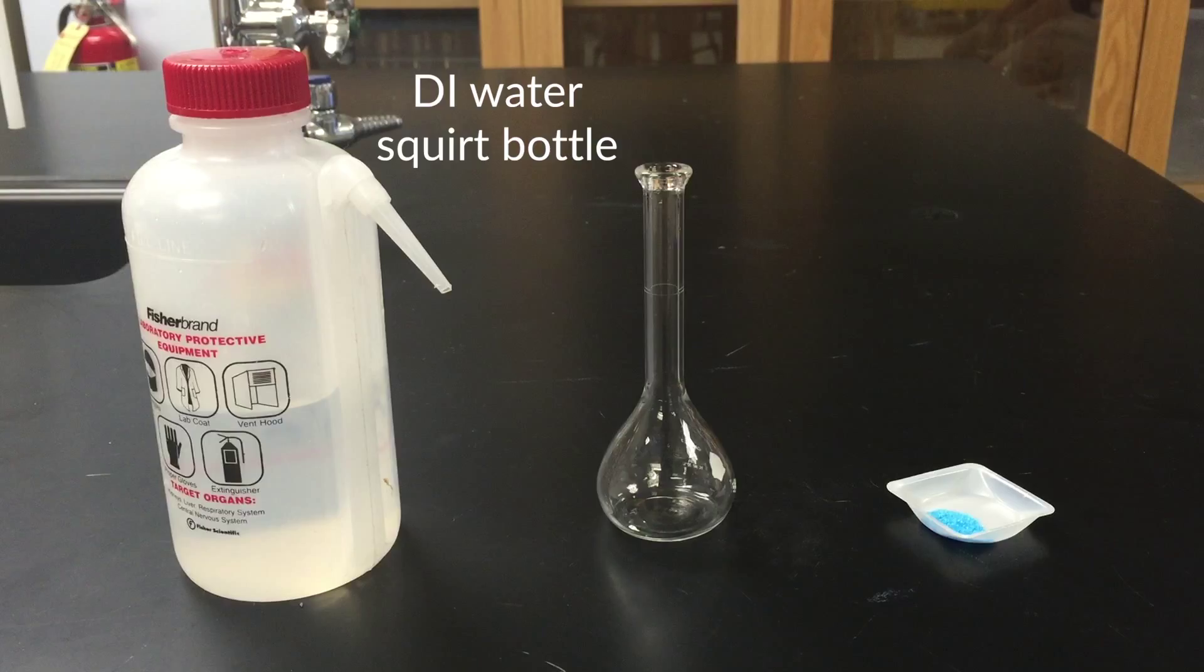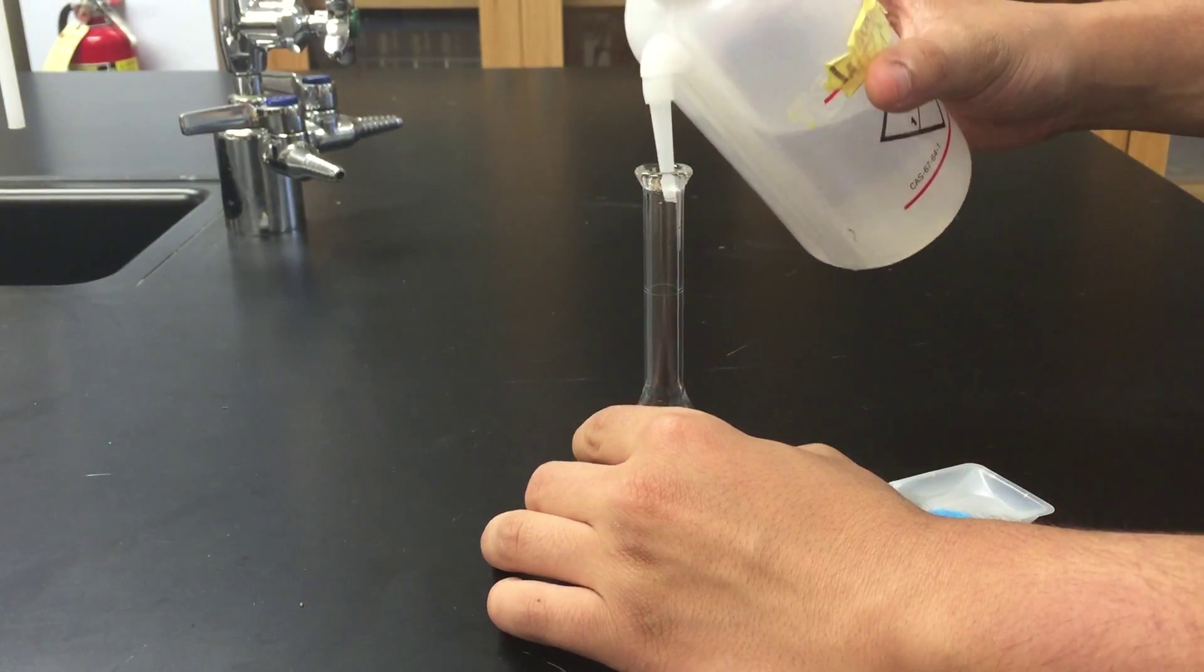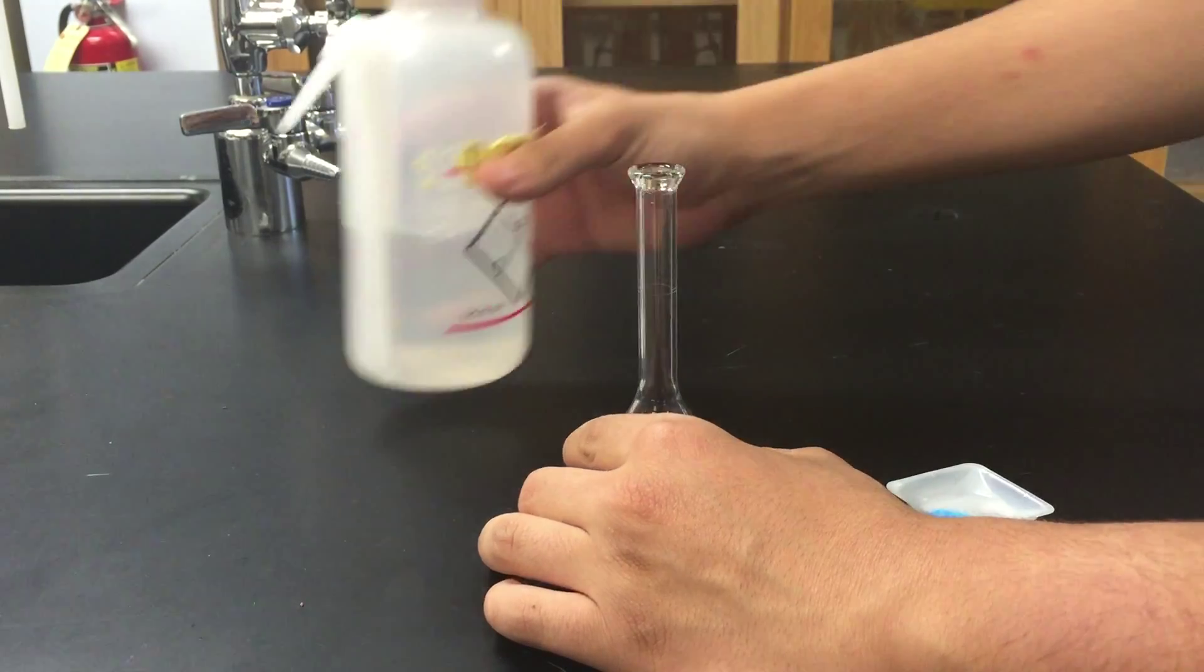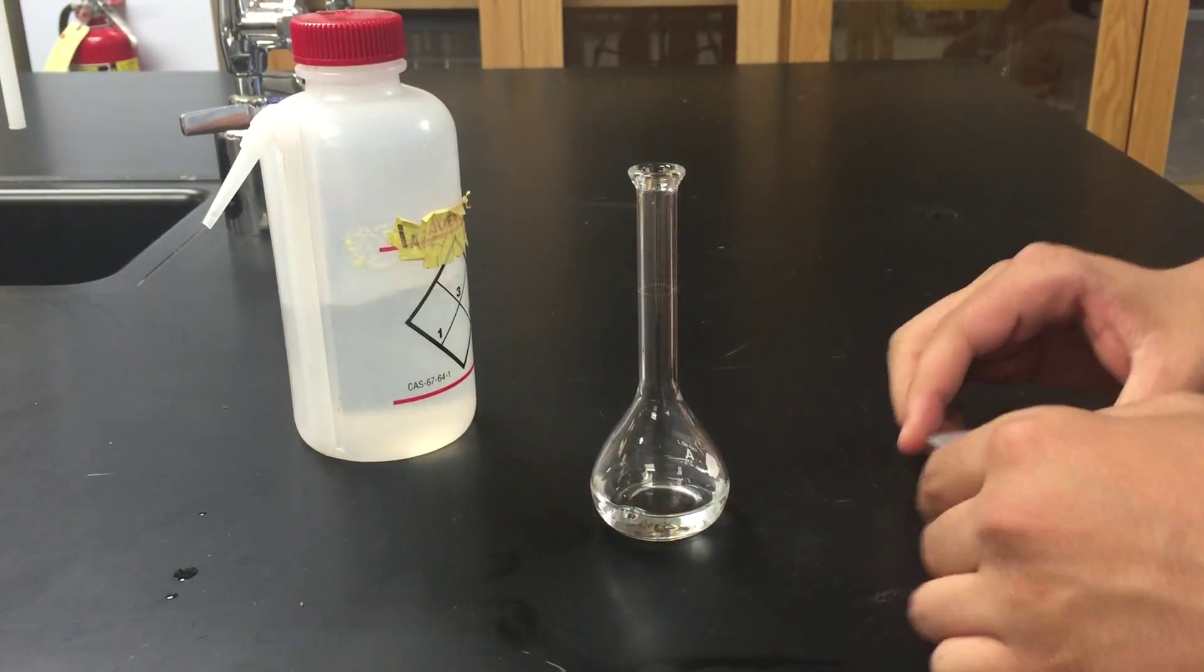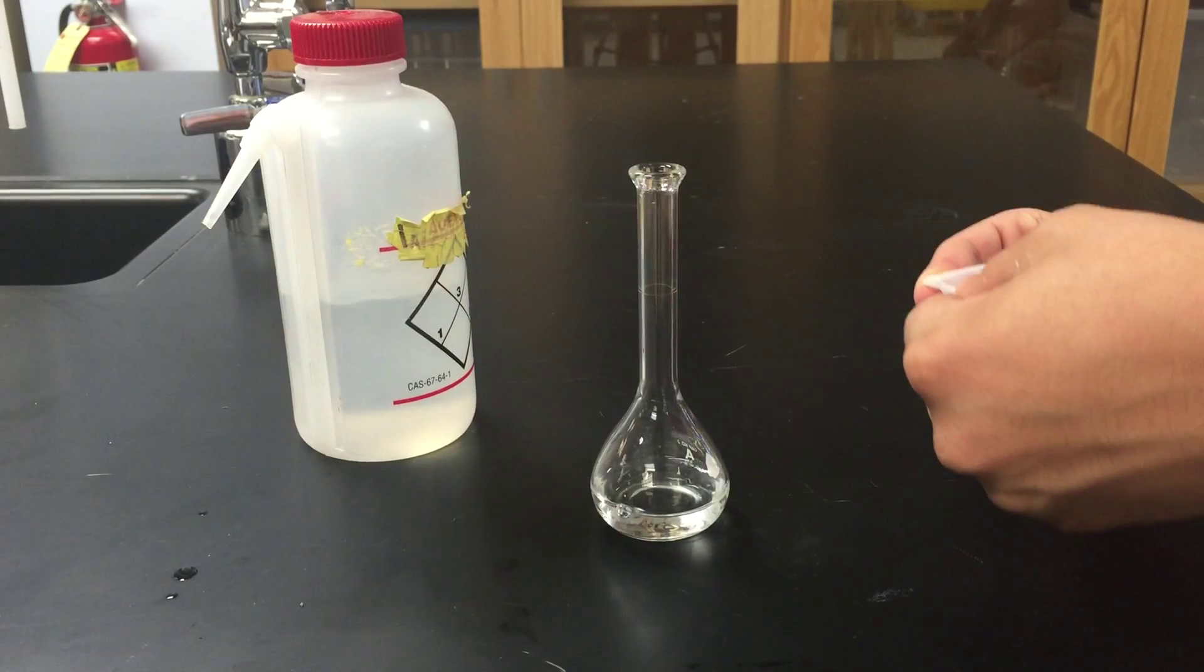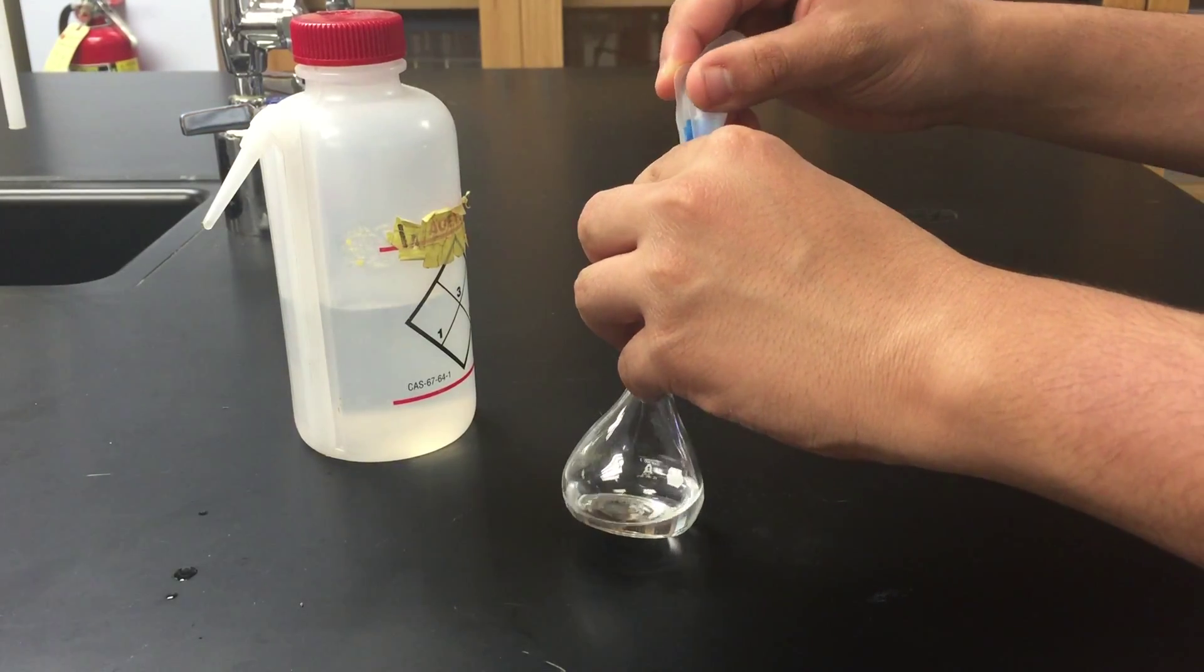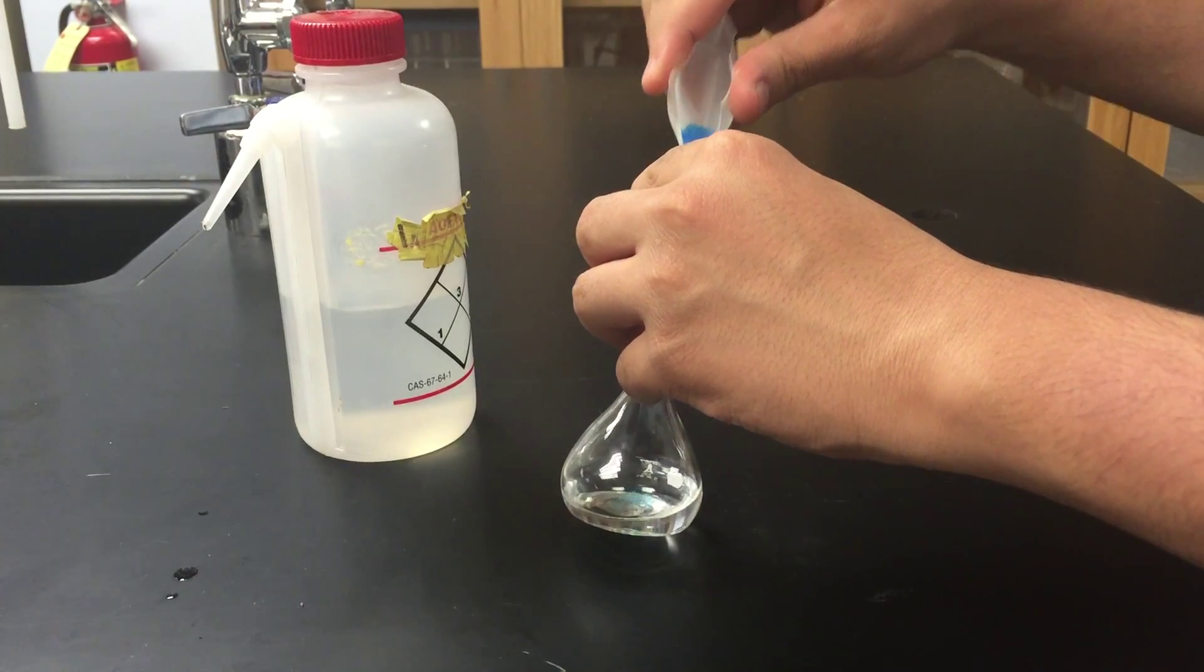Next, you need a DI water squirt bottle, a volumetric flask, and your solid substance from the previous step. Add some water to the bottom of the volumetric flask, and then very carefully add the solid substance into the flask. Creasing the weighboat beforehand can help ensure that none of it spills. If it does, you won't have the right amount of solid in your volumetric flask.